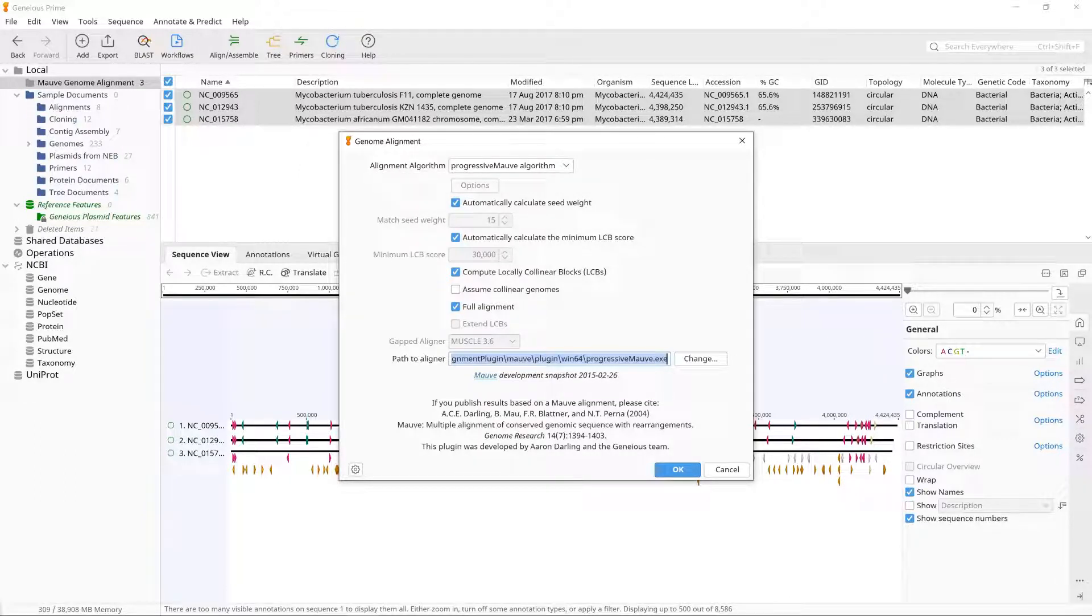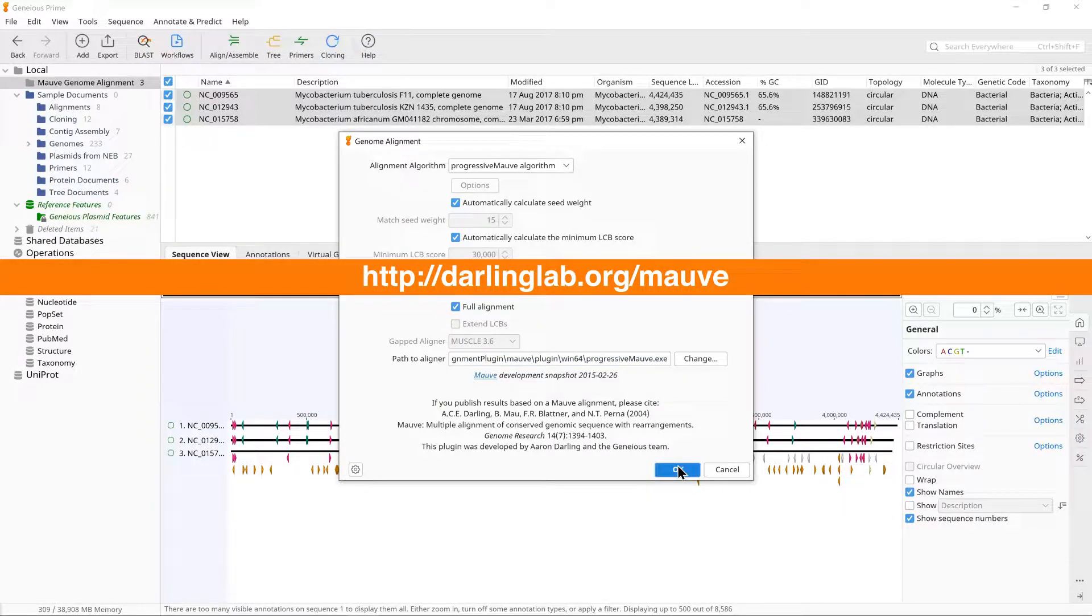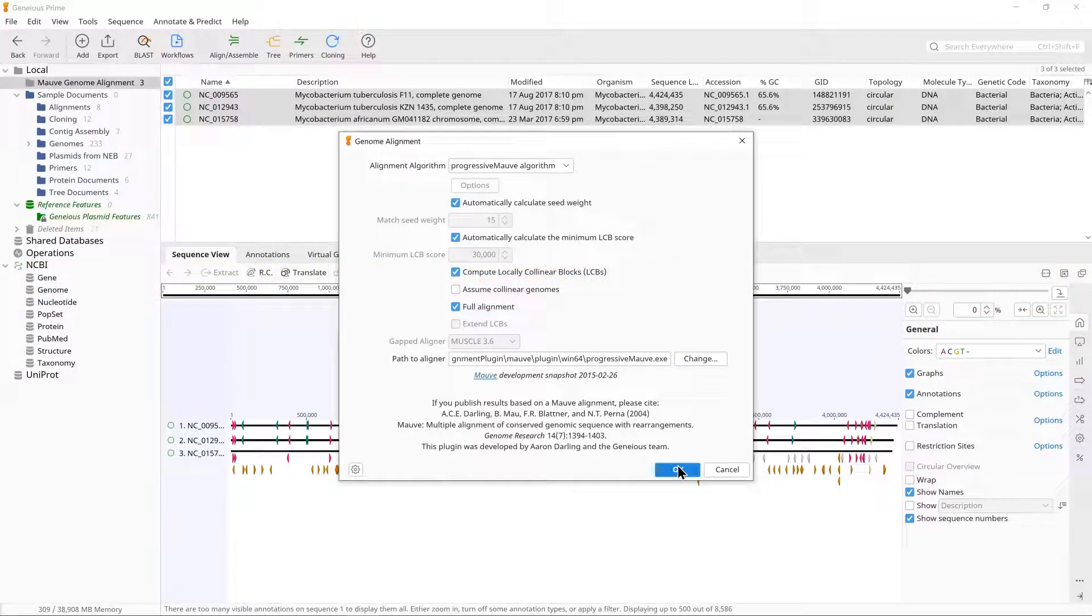For a full description of the parameters, see the Darling Lab website. Click OK to run the alignment. Note, in this example we are using complete genomes, where each genome is a single contiguous sequence.